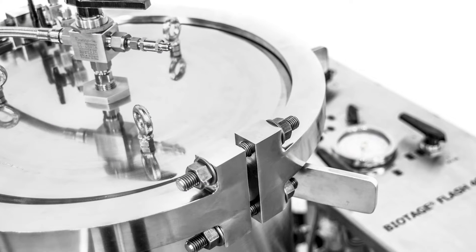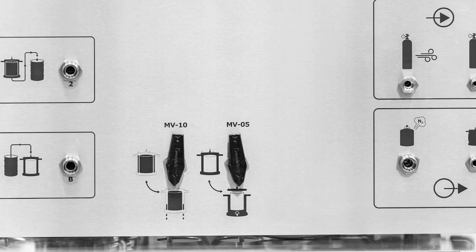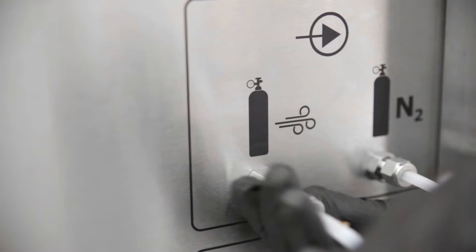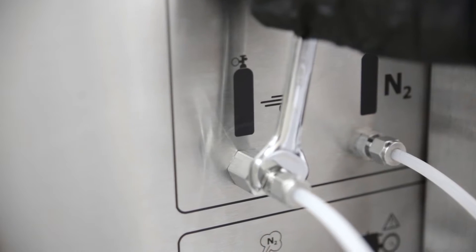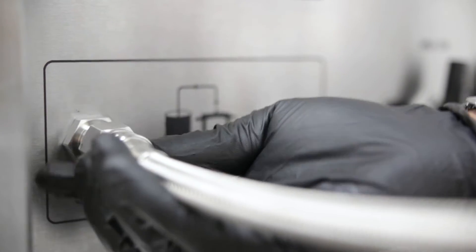Flash 400 is powered by compressed air and nitrogen which connect to the ports on the side panel. This is also where the solvent inlets and fraction collection outlets are connected.